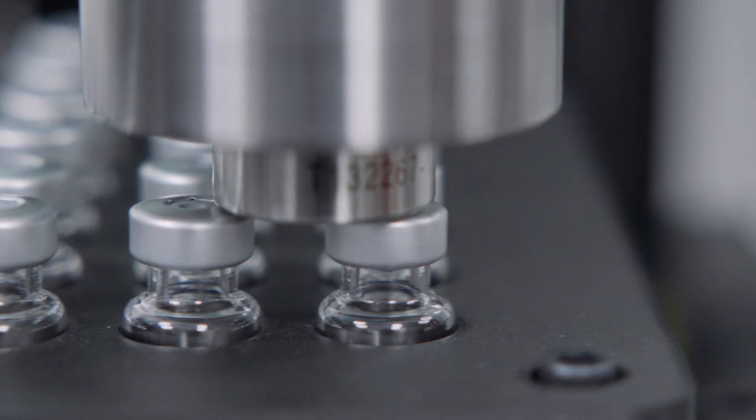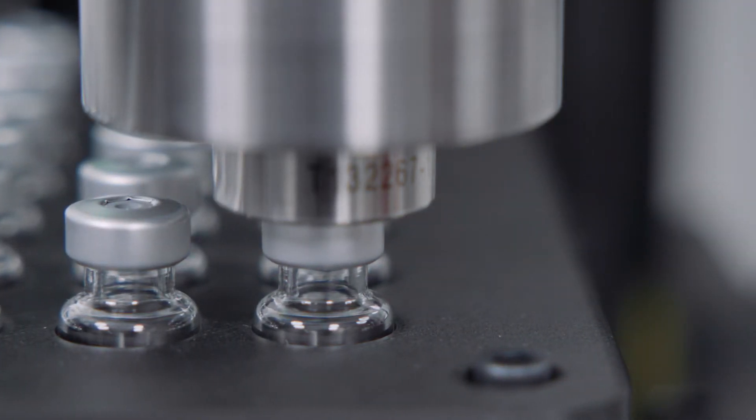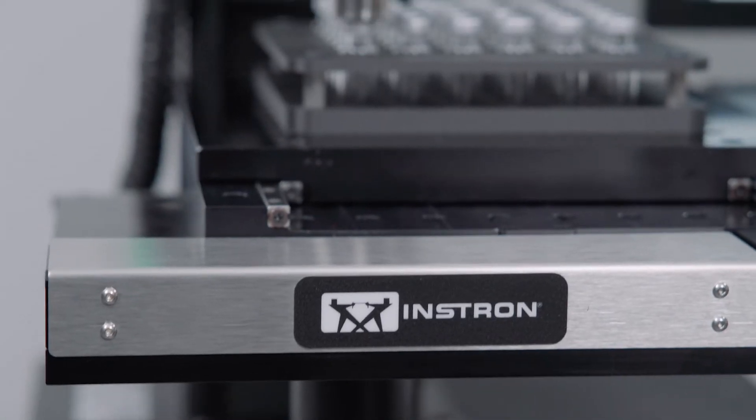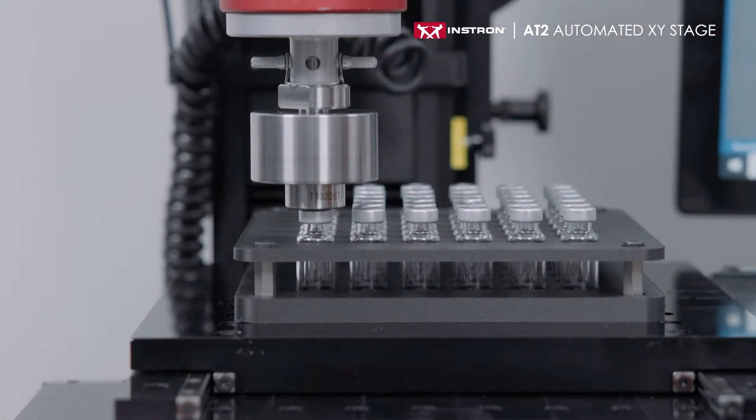To avoid testing becoming a bottleneck to innovation or on-time product shipment, many labs are turning to automation such as the automated XY stage.